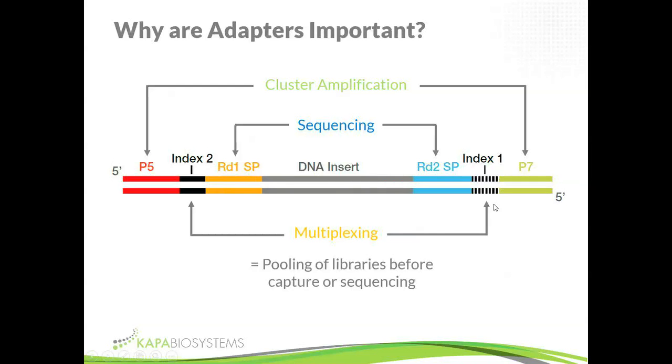And then you get other variations too. There's also a trend towards using what people call molecular barcodes. This is a different type of barcode that identifies molecules right from the beginning of the library construction process. It's a bunch of unique random barcodes that allows us to distinguish between molecules that are duplicated in the biological sample versus molecules that are duplicated as a result of library construction.